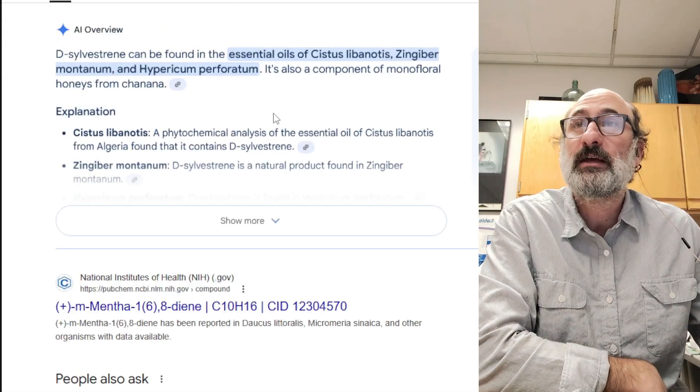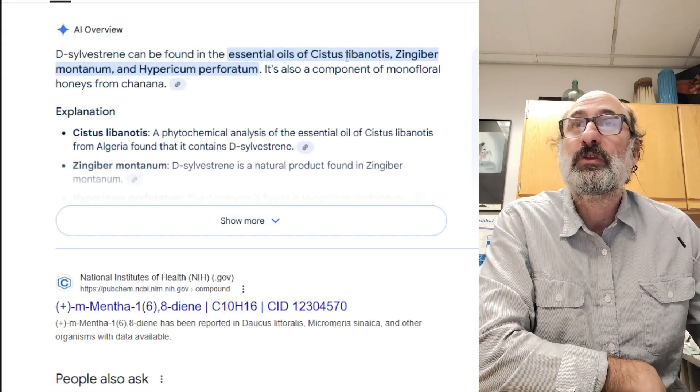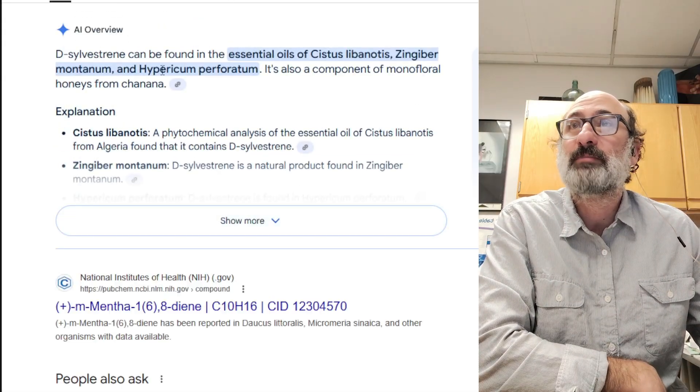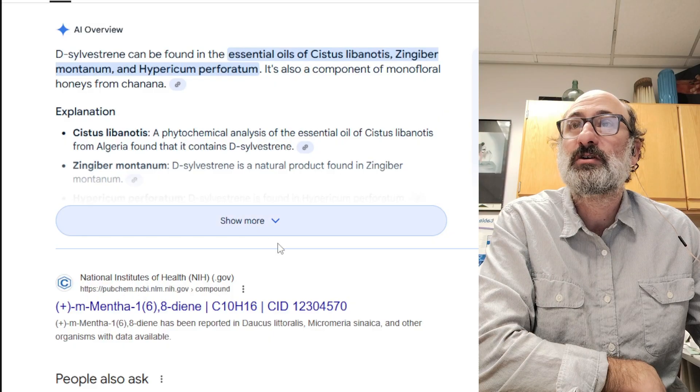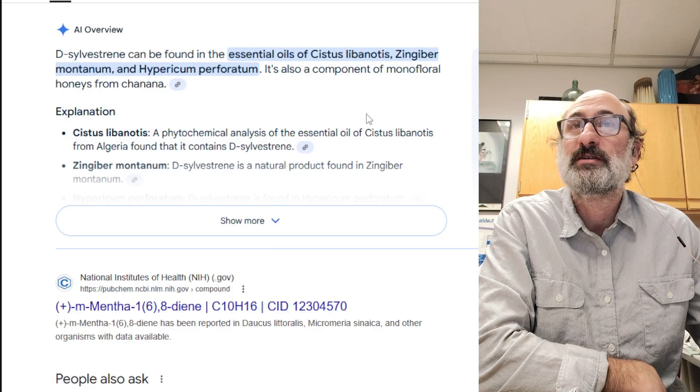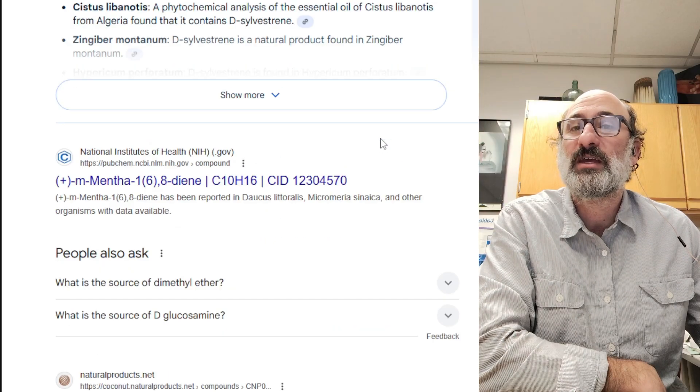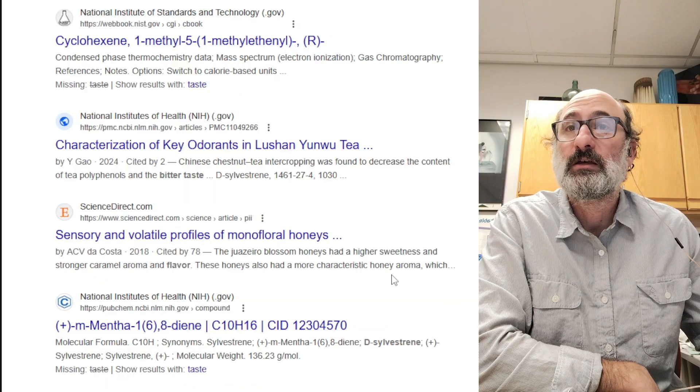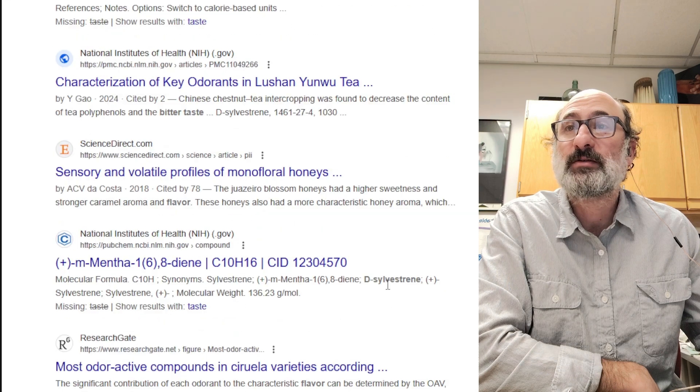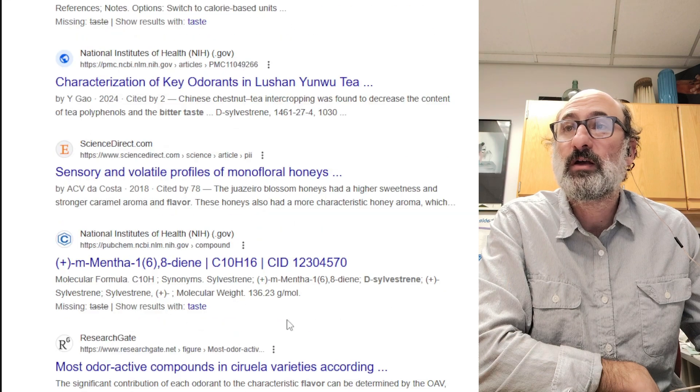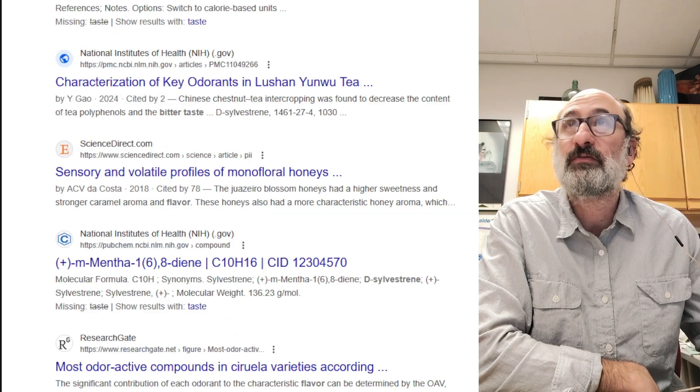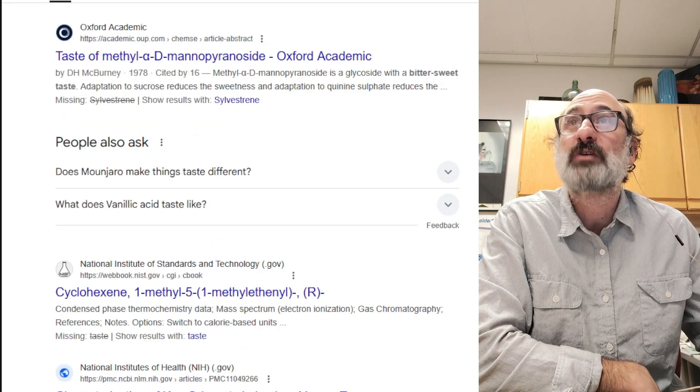What's the best source of sylvestrene? Let's see. Looks like it's kind of like maybe ginger, citrus maybe. I don't know. That's a weird one. Anyways, very nondescript.